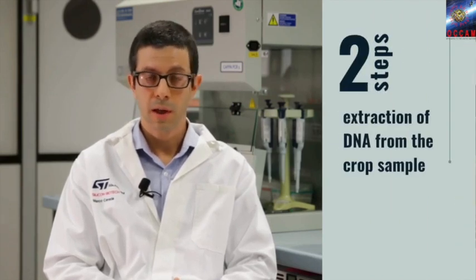Tackling these limitations is the objective of STMicroelectronics within the EWABELT Project, with the development of an innovative molecular analysis workflow, which includes 2 steps. First, the extraction of DNA from the crop sample. We have set up a simple protocol for maize flour and peanut specimens, which requires very little equipment. This protocol was tested on samples provided by the University of Sassari.